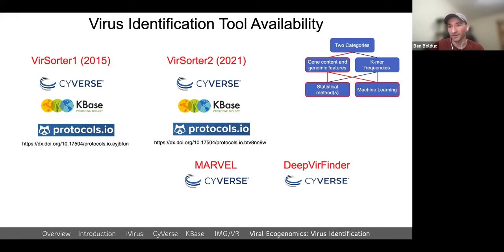However, Deep Virofinder, trained on shorter k-mer frequencies, can identify largely successfully those genomes that are below 5 kb, 3 kb, etc. However, I generally don't trust things below 1 kb and even up to 3 kb, even predicted by Deep Virofinder, because there's a huge false positive rate once you start getting into that short of a length.